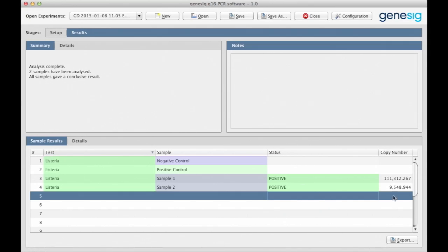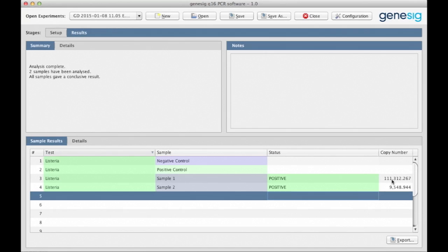Another really nice feature is displayed in the column here on the right. Here the software gives an estimation of the amount of the target that is present. This number tells you how many copies of your target DNA were present in your sample. For example here, just over 100,000 and for the second sample, just under 10,000.